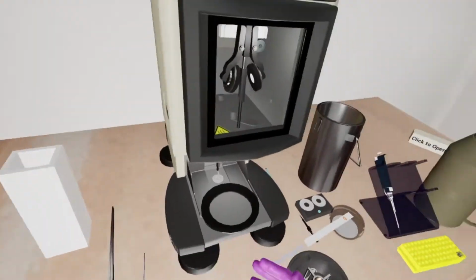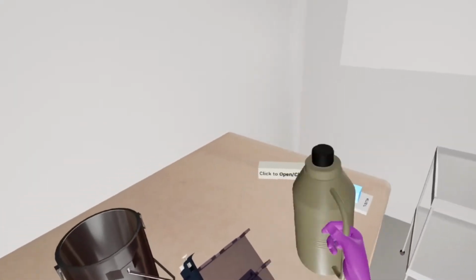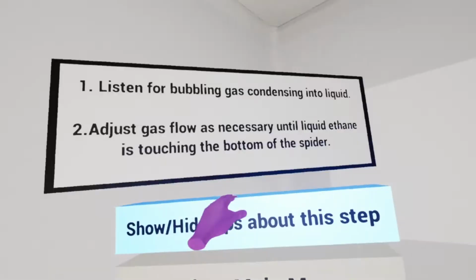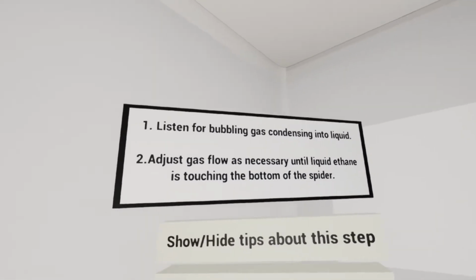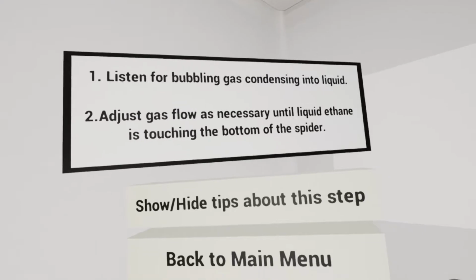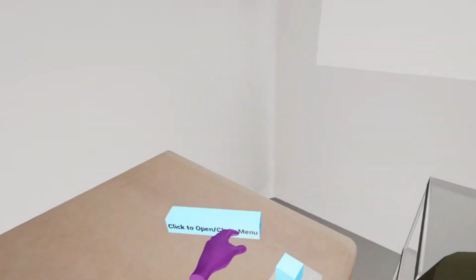Then, pour liquid nitrogen into workstation. After adding nitrogen, recap the dewar. Listen for bubbling gas condensing into liquid. Adjust gas flow as necessary until liquid ethane is touching the bottom of the spider.